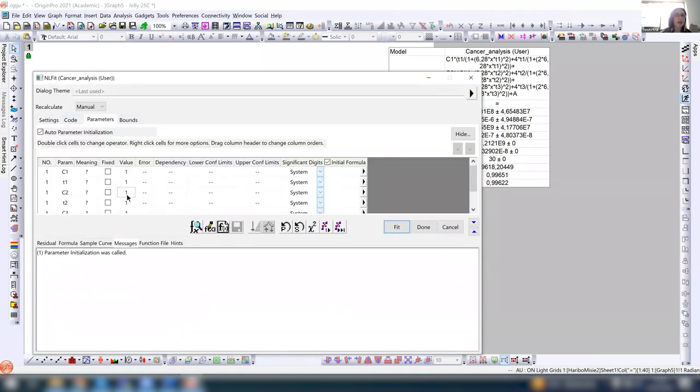So I have to do it again. I want to plot the first term, so I set all other terms to 0 and fix them, and I want to have only the first one. So it's 1.4658 and 2.43 minus 6.